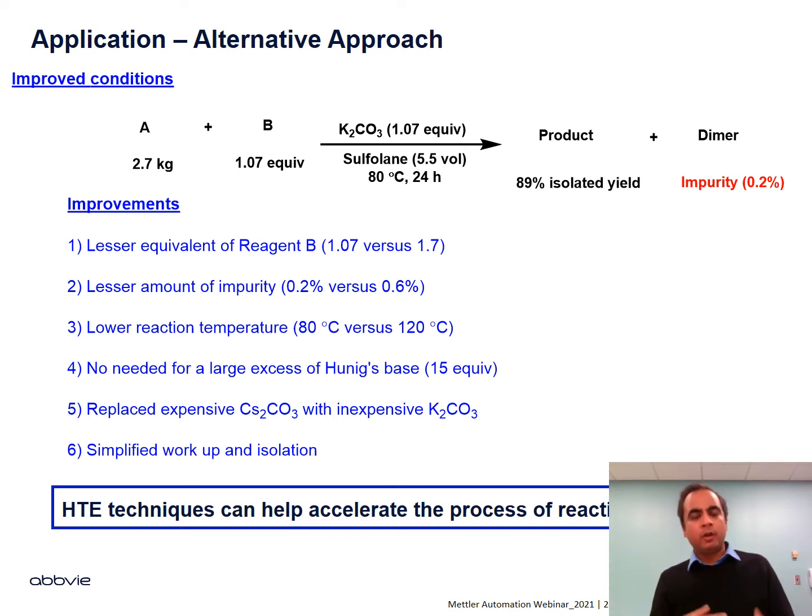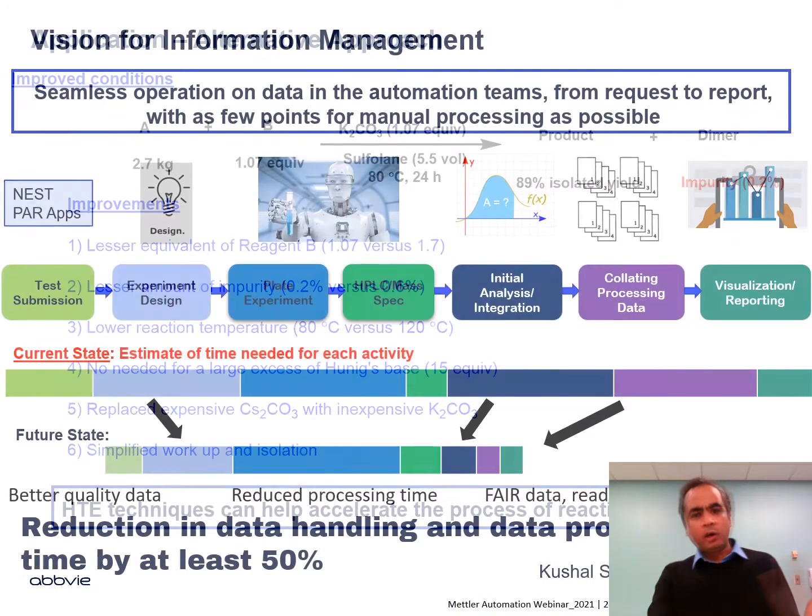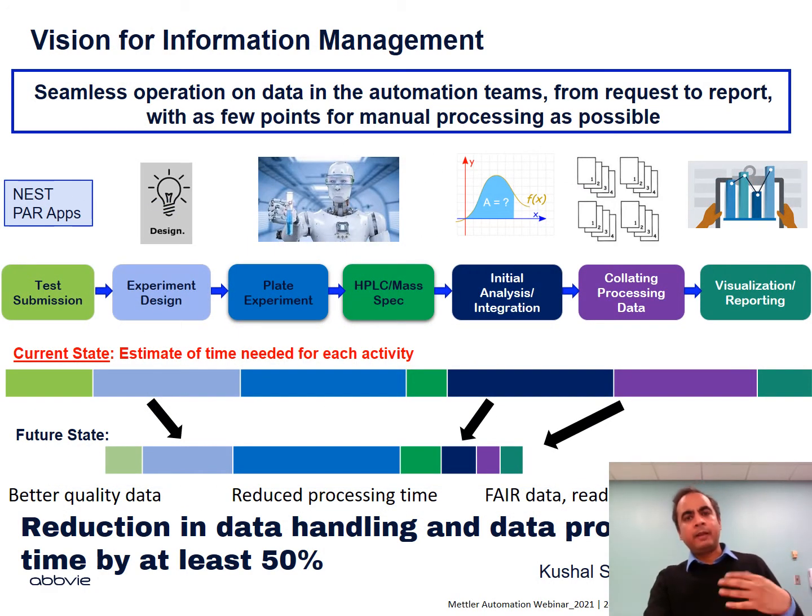So this kind of workflow and success is really helping us build the HTE and automation culture within our organization. So I will not give you any more example, but in my remaining time before Moise comes back, let me talk about our effort in information management. We really cannot reap the full benefit of automation until we have a system for automated, systematic, error-free data capture that can be easily mined. Right? I know every company has effort for that, and this is the approach we have taken, and let me walk you through that.